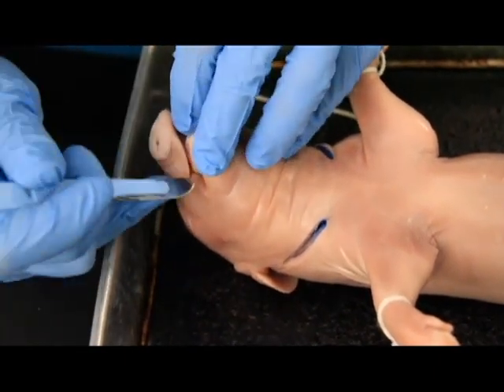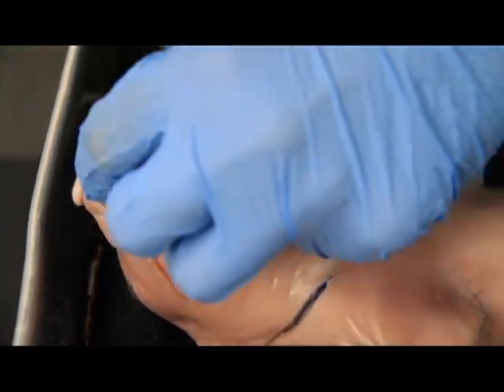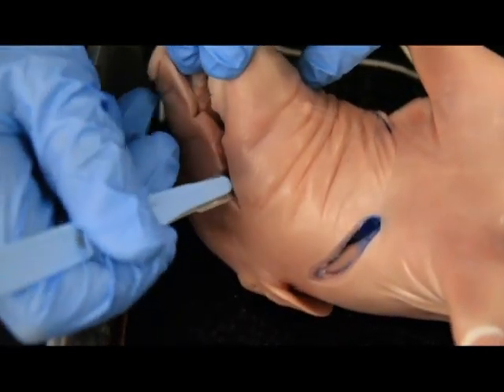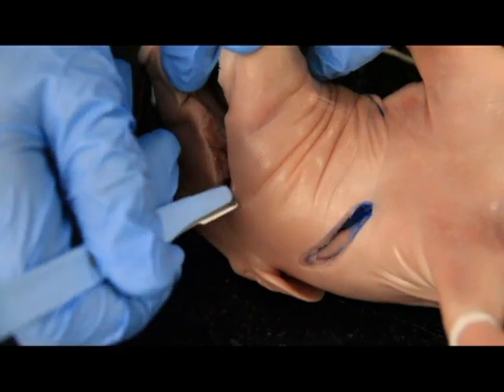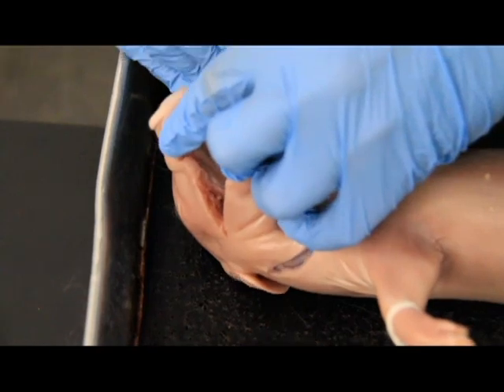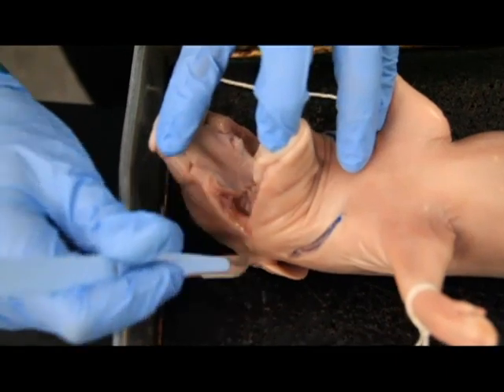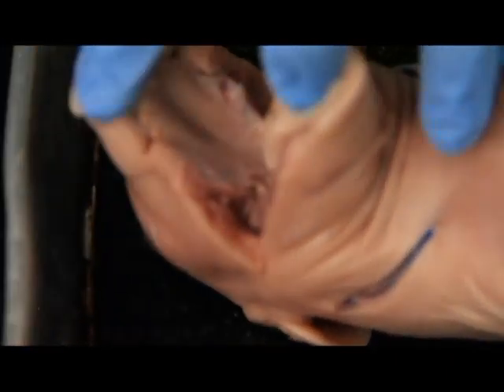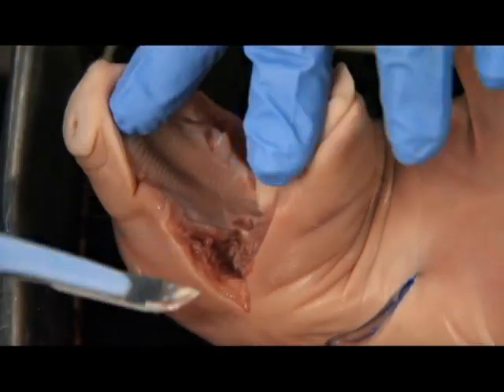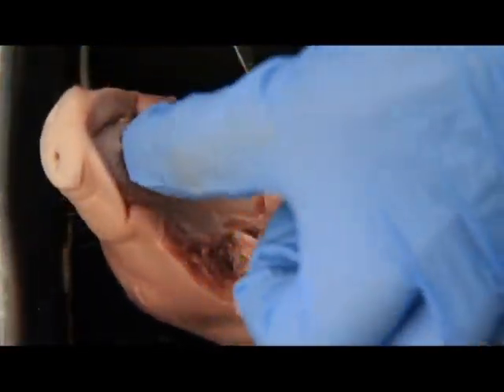So what we're going to do is we're going to open his mouth here, and we're going to begin our incision on each side of the mouth. I know it seems a little brutal, but we got to do it. So then you can actually hear where the scalpel starts breaking into these bones. And again, you really want to focus on going down the throat and not into the head. So as I'm cutting along here, I'm just cutting enough to get down the throat. So you don't want to lob his actual head off. So you just need to cut those muscles and those bones that will prevent you from going down the throat.